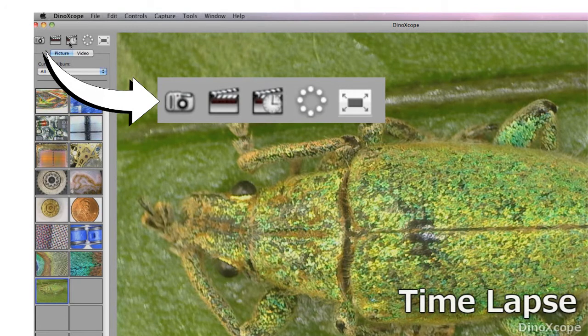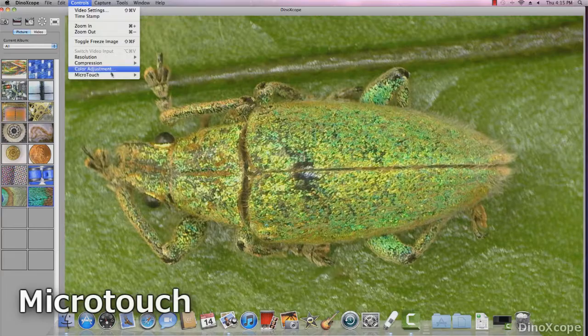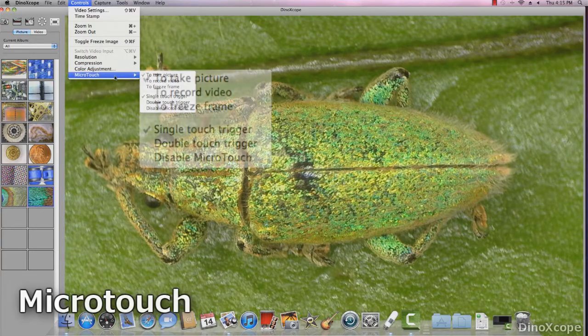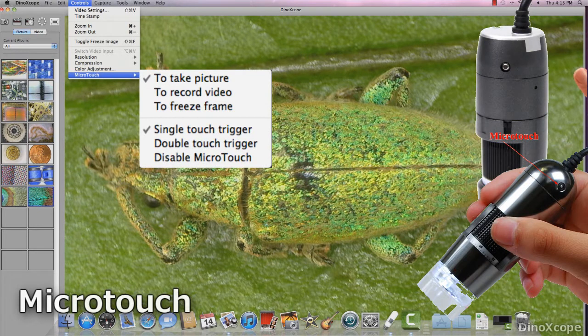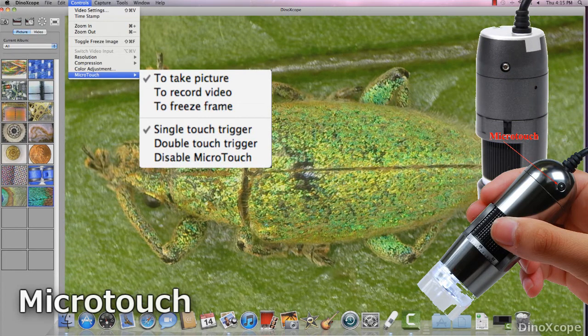The third button is for the time-lapse feature. Set micro touch to single touch, double touch or disable it in the menu options here.